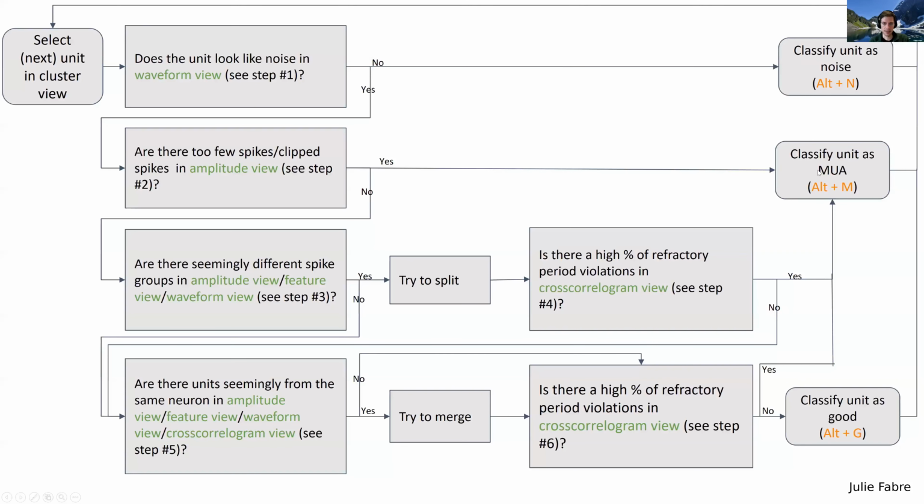There are many analyses, like for instance, if you're just trying to calculate receptive fields and see whether the stimulus you presented was in the receptive field of the neurons, maybe you know that the receptive fields of nearby neurons are all the same, and you can throw them all together and get a good receptive field estimate of the local population of neurons. So that would be something where you can include all of the multi-unit spikes. So we're not going to throw them out, we're not going to classify them as noise, but we're not going to analyze them for analyses where we need single neuron isolations.